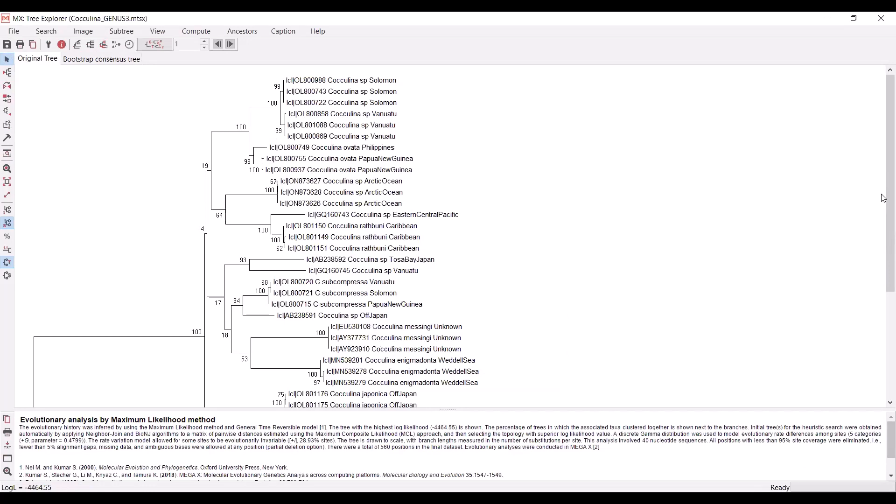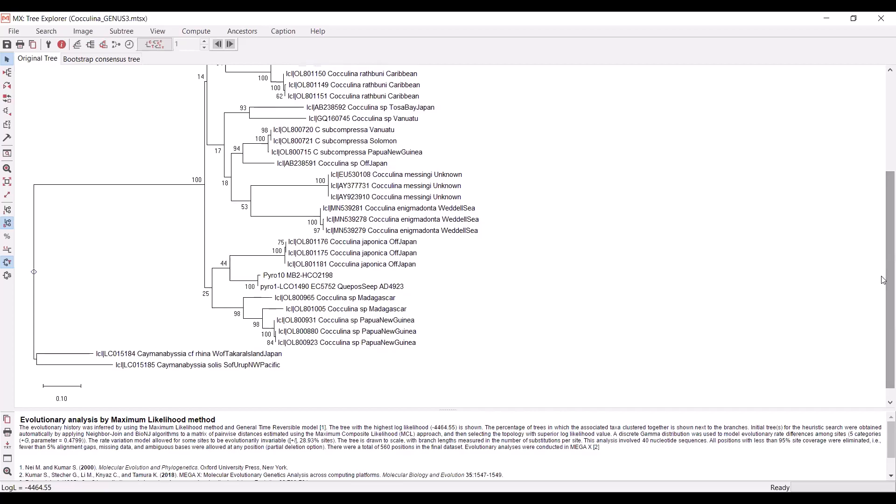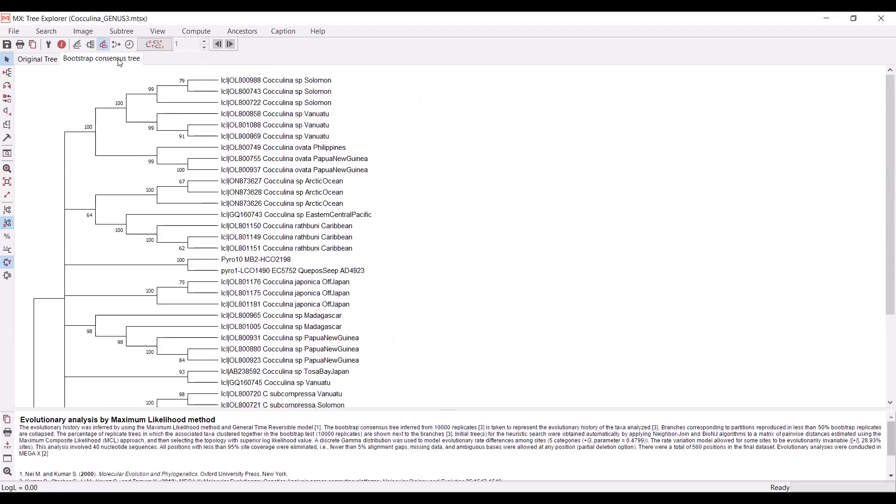When your tree is done running, it'll look something like this. It's essentially the same topology as before. But this time you have this extra tab here, which gives you the bootstrap consensus tree. This is the tab that reports the actual bootstrap confidence of your branching patterns.